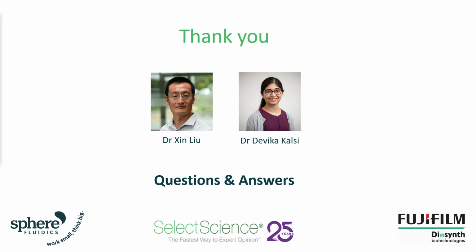Thank you. And another one here for Devika: how many Cyto-Mine runs do you perform in one CLD project? In one CLD project, as standard, we would carry out 5 Cyto-Mine runs. Each Cyto-Mine run would have one transfectant pool put into the machine to generate cell lines derived from that pool. So you'd have a diverse set of cell lines by the end, because they're coming from 5 different transfection events. Thank you. And what is the max number of picodroplets you can evaluate in one Cyto-Mine run? In one run, the user has the option to choose the number of droplets generated for the downstream process, ranging from about 1 million up to 2 million droplets.